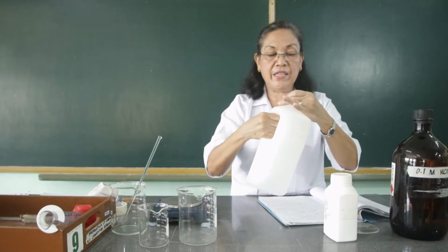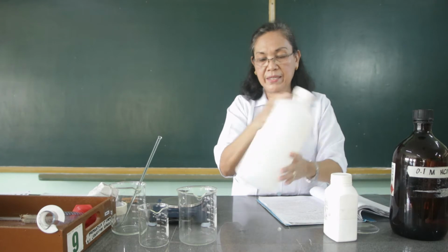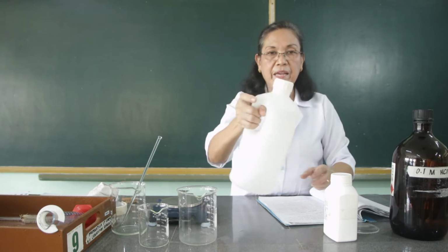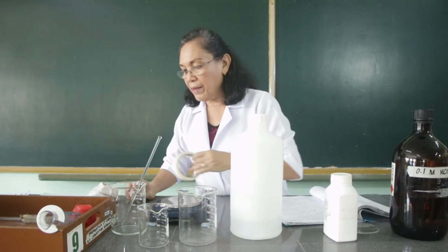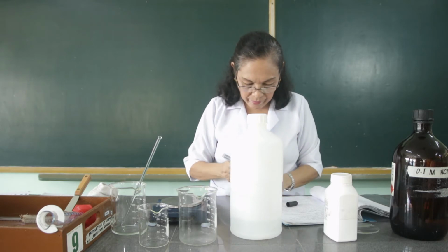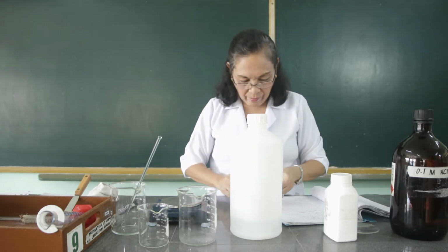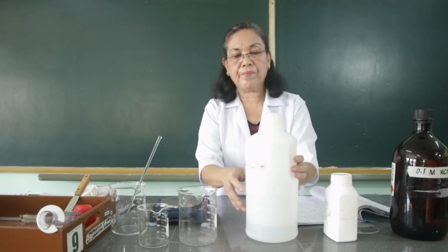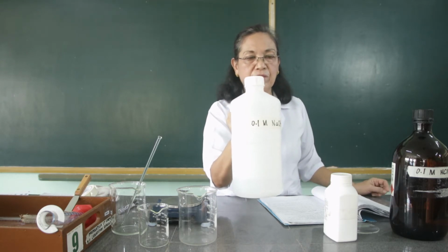So we are going to shake this. This is how to mix well. And we will label this as the 0.1 molar sodium hydroxide solution. So this is the 0.1 molar sodium hydroxide solution.